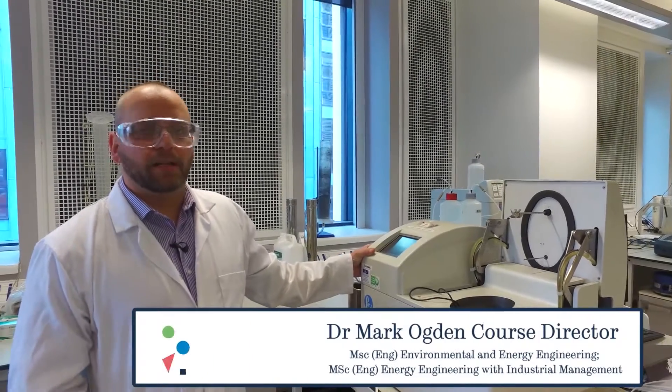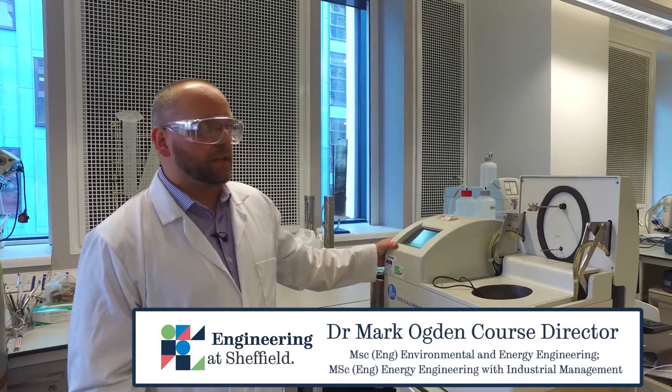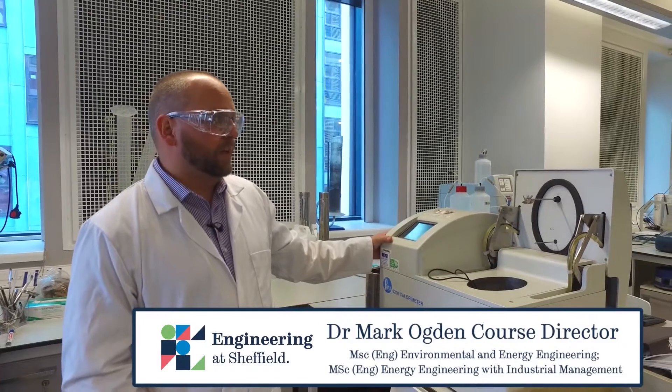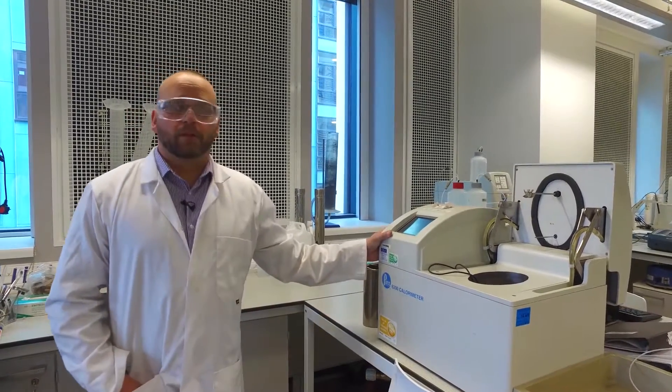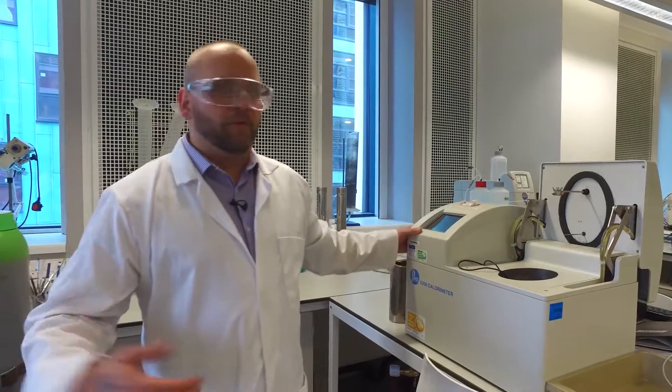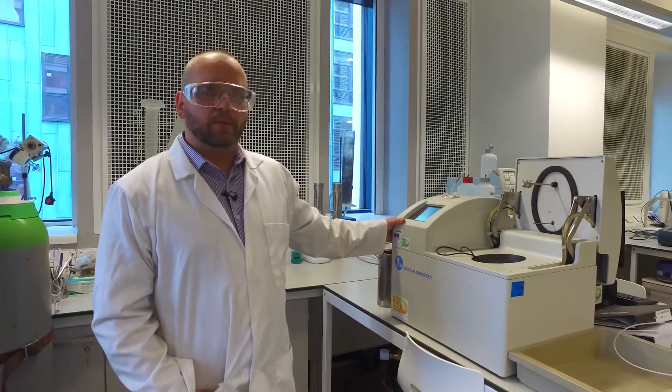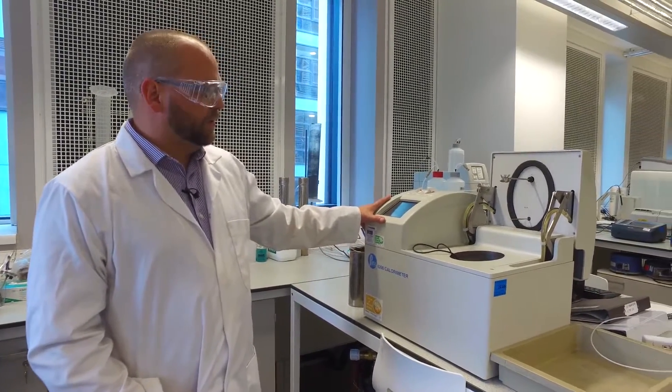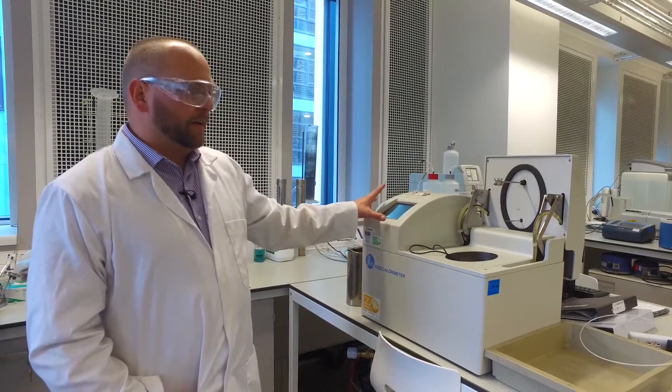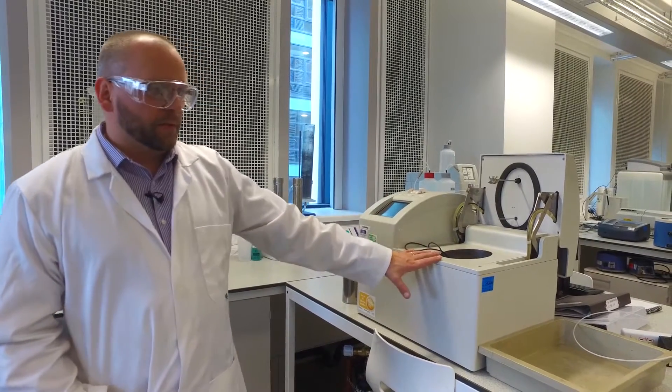Currently we are in C10 which is part of the analytical labs and the practical labs that are available for the postgraduate taught program. This is one of the instruments that the students will be using, which is a bomb calorimeter.